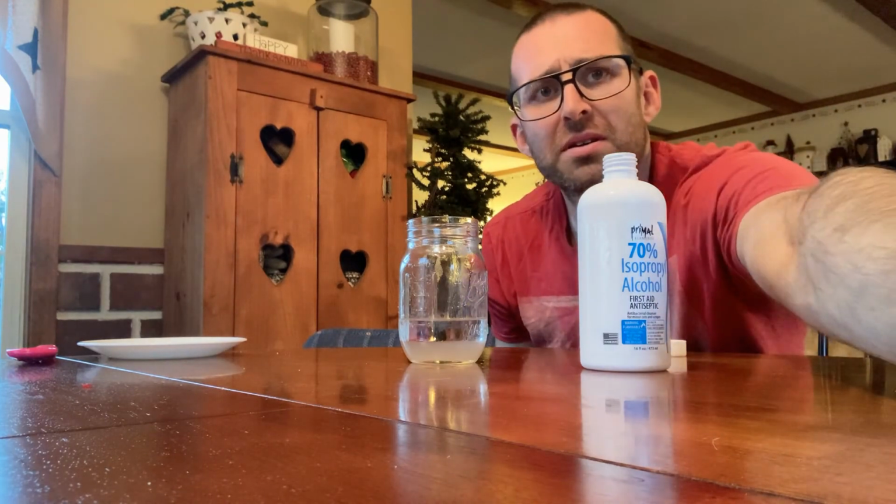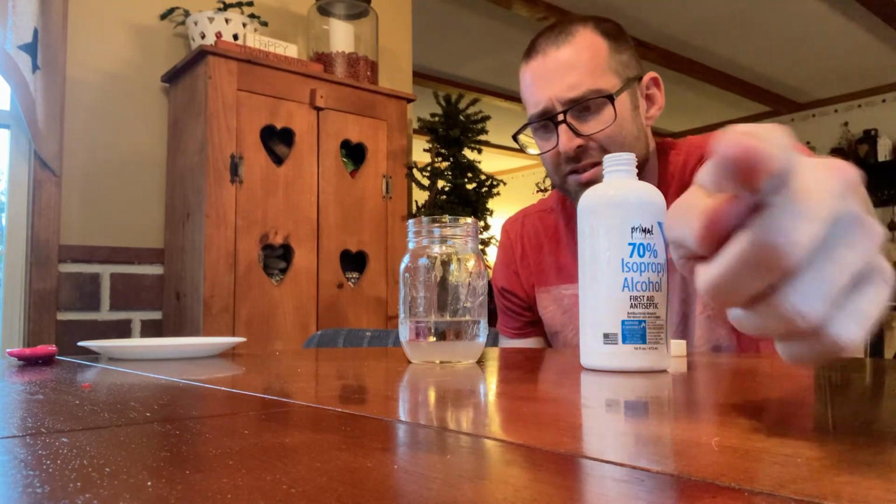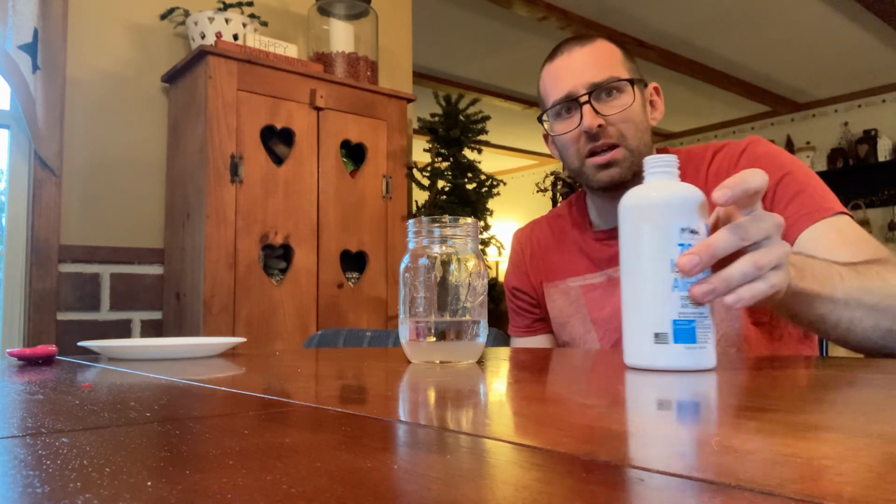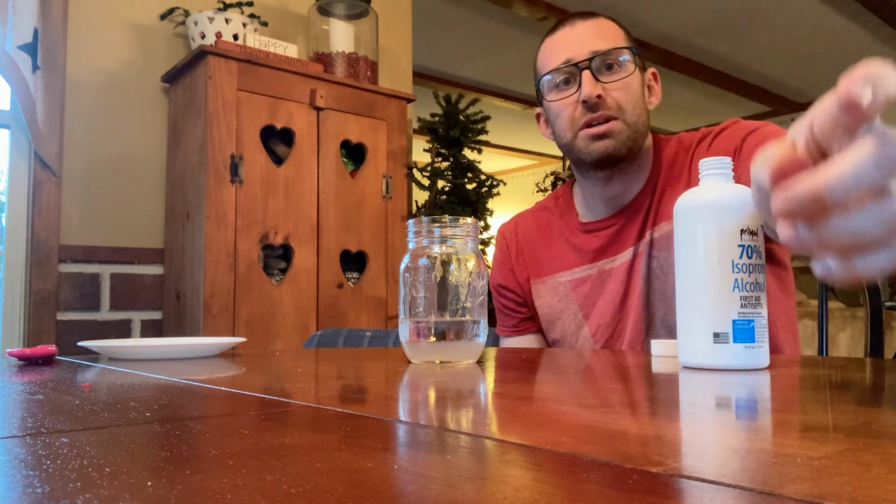So if you look, oh, you can see it there. You can see the alcohol layer up on the top right here. And now you're going to wait a couple more minutes. So I'll restart this in about 10 minutes.